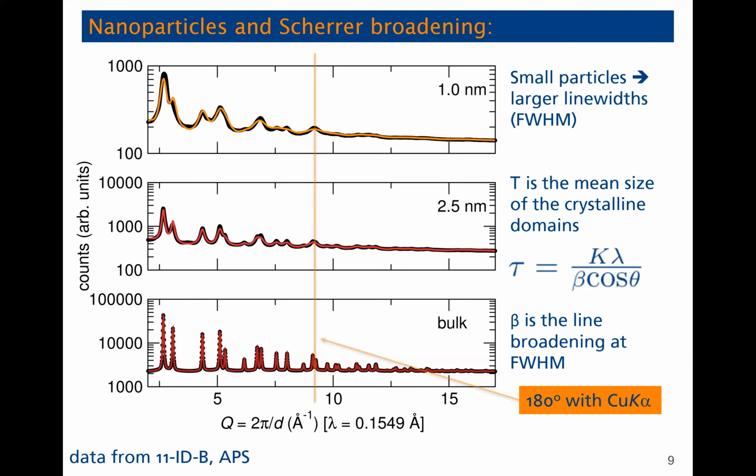And if you have enough of those planes, then even when the path difference between the incoming beam and one reflecting off of a lower plane is just slightly off from an integer of the wavelength, you would get destructive interference somewhere, because you have so many different planes. If it's shifted a little bit, you'll have one that is completely destructively interfered.